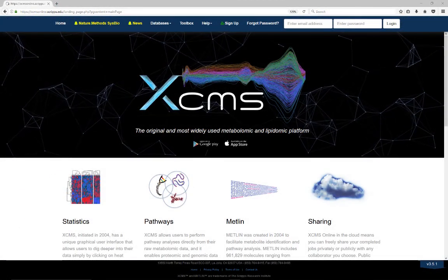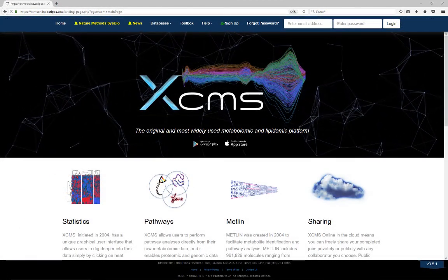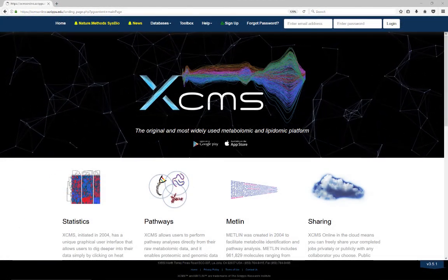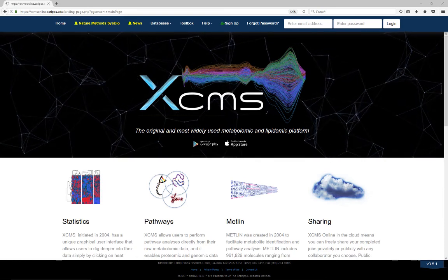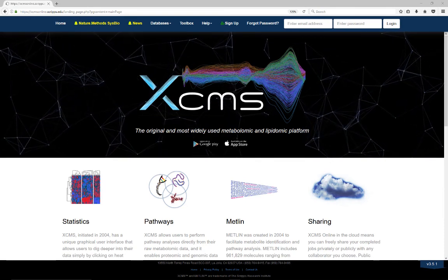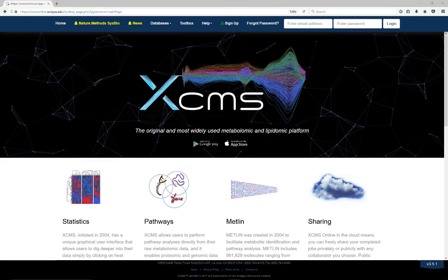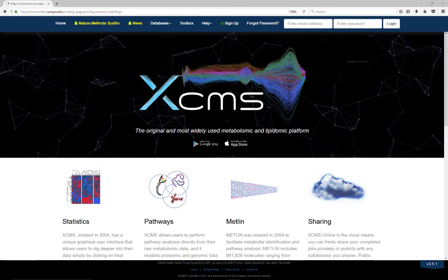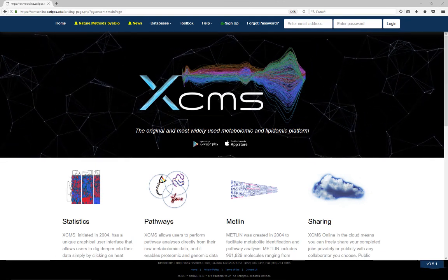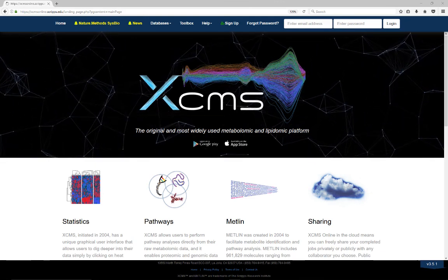Overall, a modestly experienced user should be able to execute the data interpretation in our systems biology platform in about 30 to 40 minutes. Thank you for using XCMS Online. Feel free to contact us if you have any questions.